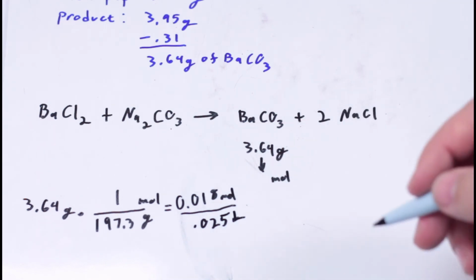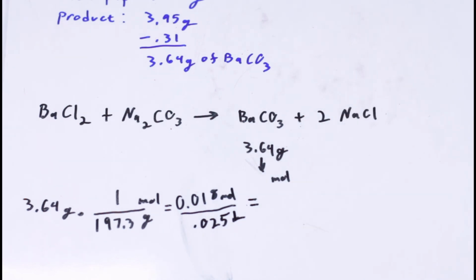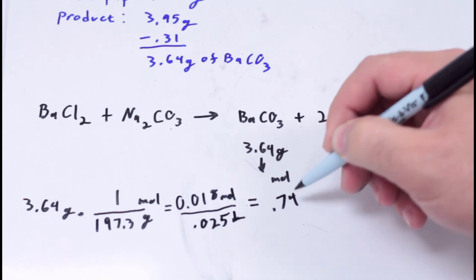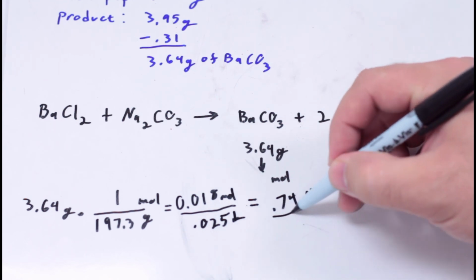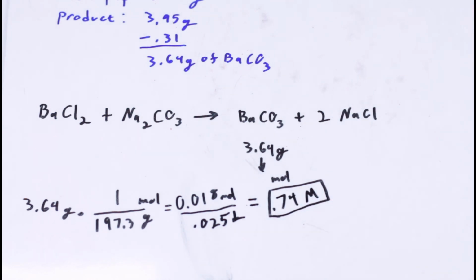Now, considering this is your first gravimetric analysis, your results may be as low as 70% accurate without hurting your grade. Your final precipitate can be thrown away in the garbage. Everything else should be cleaned and put away before you move on.